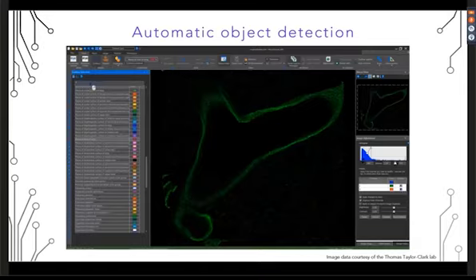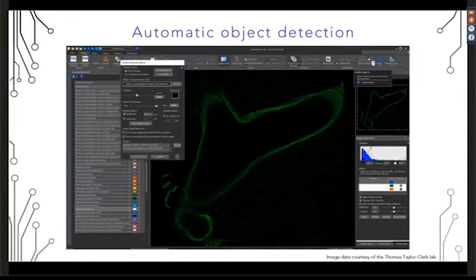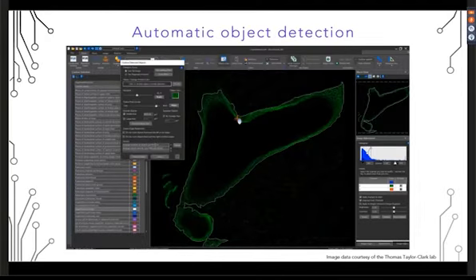Pick an anatomy term from the contour selection toolbar. In this example, we chose the segmental bronchus. In the Trace tab, open the Outline Objects tool to begin segmenting. Outline a structure by clicking a representative object in the image. Neurolucida 360 will display a preview of the outline objects here in white.